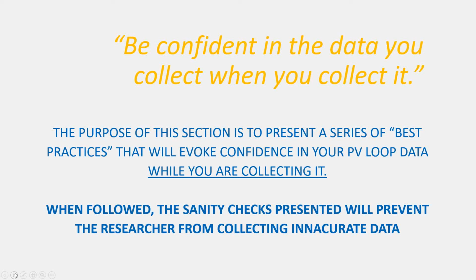So the purpose of this first section of the presentation is to present a series of best practices that will evoke confidence in your PV loop data while you're collecting it. So when followed, the tips and tricks and sanity checks will prevent researchers from collecting inaccurate data.